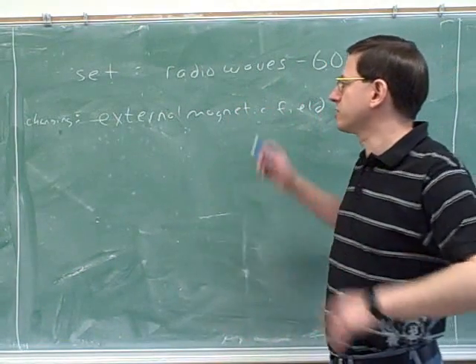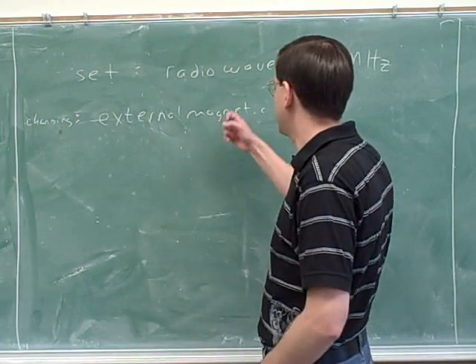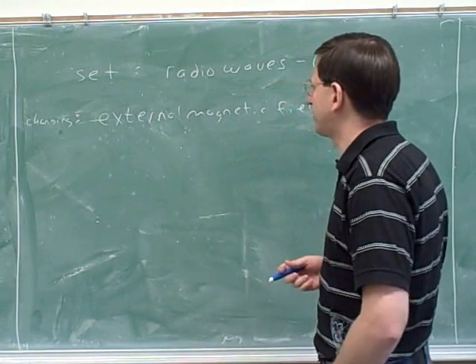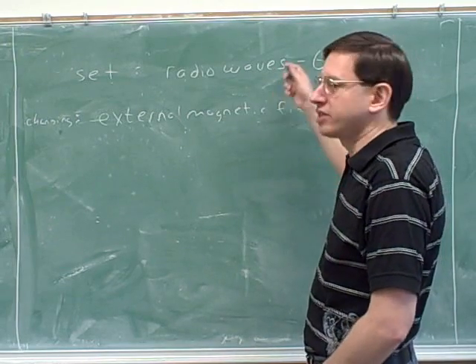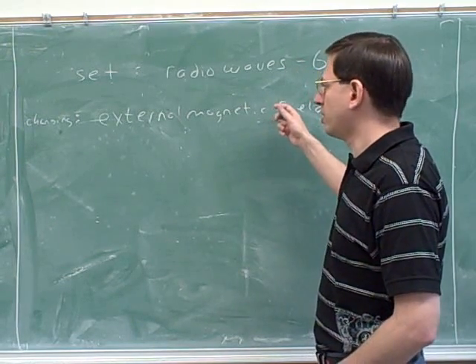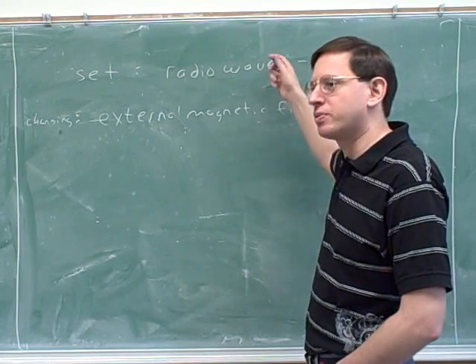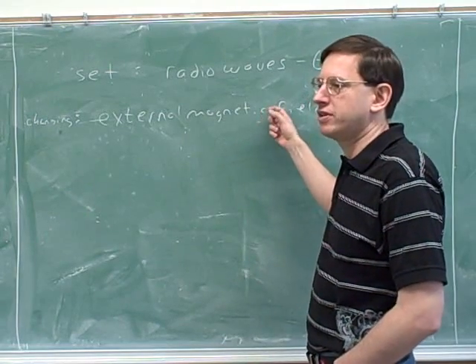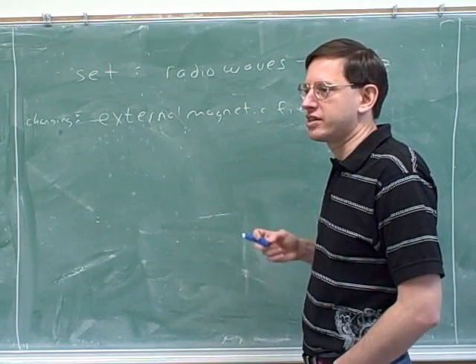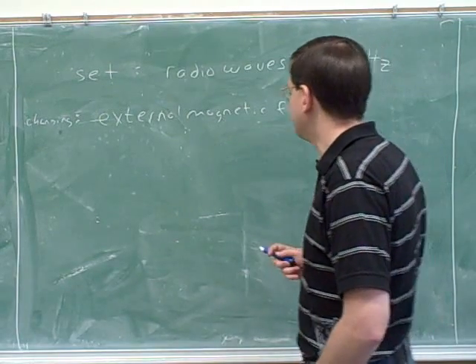One of the very first skills we have to go over is how to tell whether protons are the same or different. Like I said, we won't spend too much time on how this works. So you change the magnetic field until the protons absorb, and then you change it some more, and maybe some different protons will absorb. And then you change the magnetic field some more, and some different protons will absorb. The computer makes a note of all the different levels of the magnetic field where you got an absorption, and you can use that as clues as to what types of protons exist there.